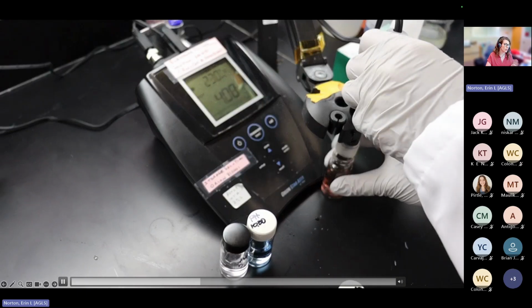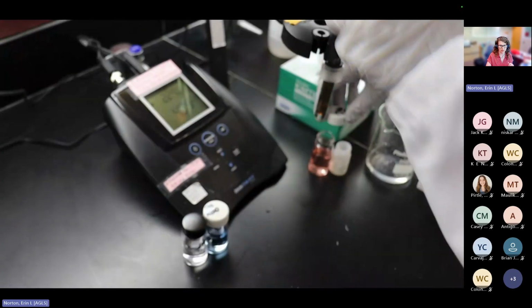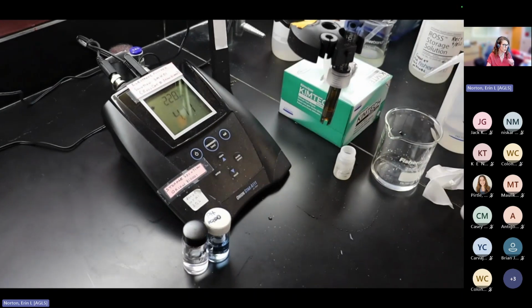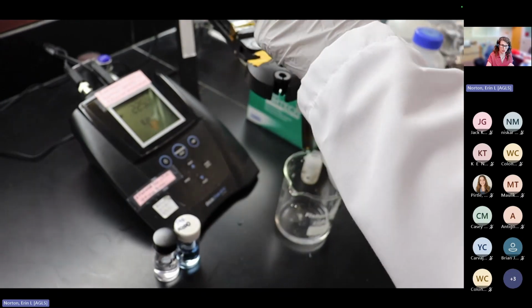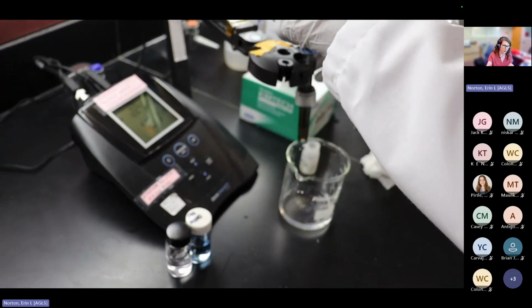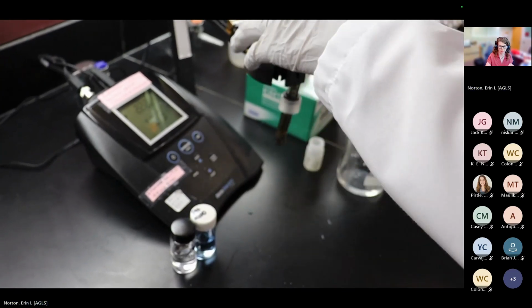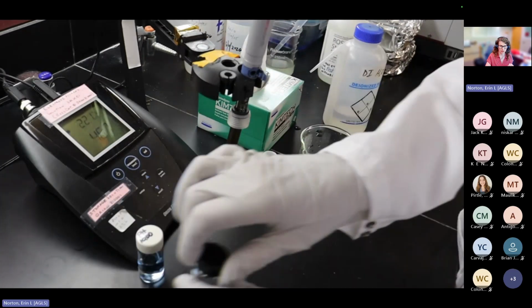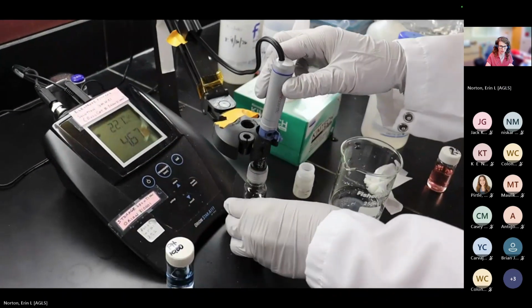Each one, please read your instruction manuals carefully, because there are some nuances between pH meters. Before we use the next calibration, we are cleaning it. You don't want any carryover from one sample to the next, even in the calibration. We're going to use a pH calibration of 7.0.